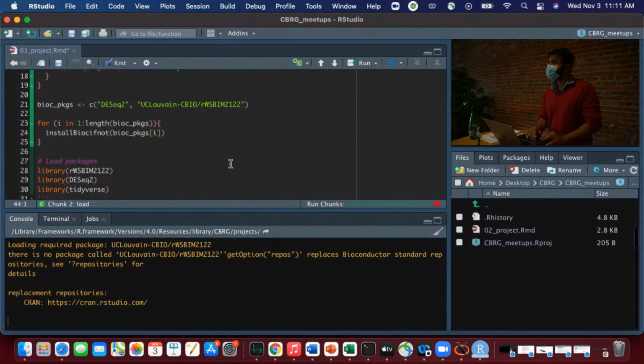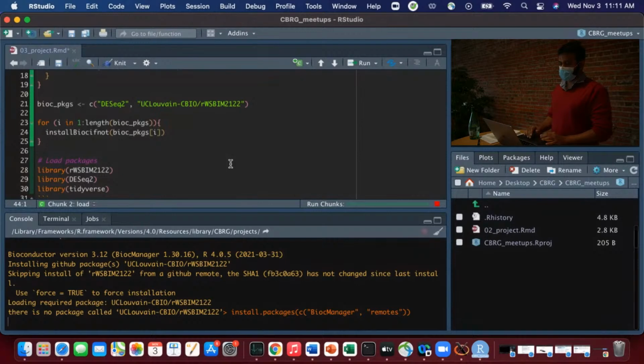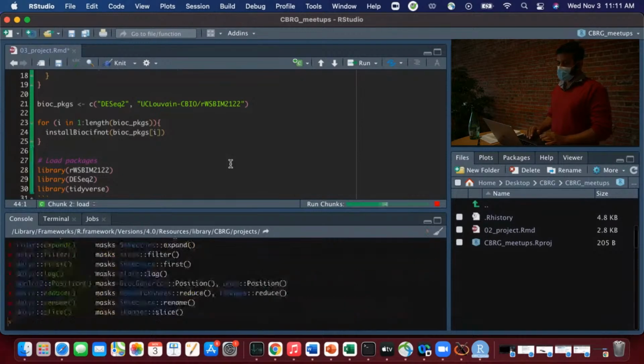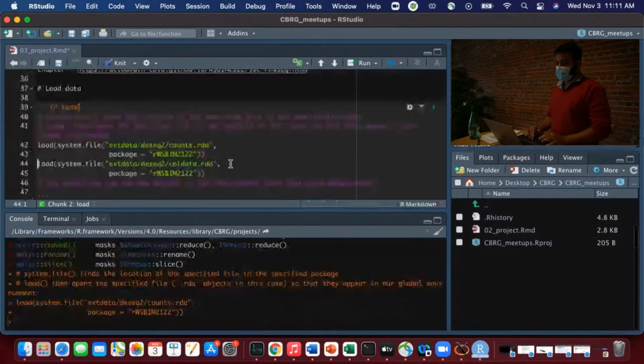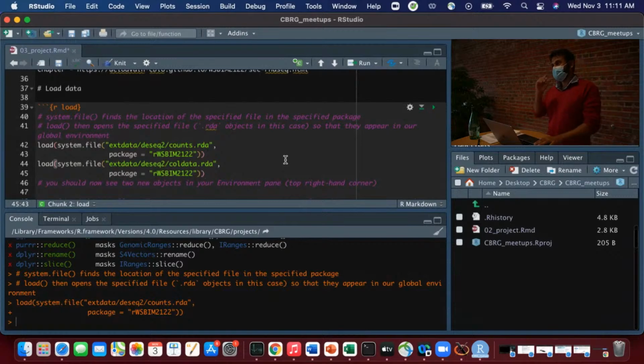Is there a reason why when we run some of these lines, we don't get as much info in the console as you're getting? Should we be seeing all of it? Are you getting any error messages? No, it's just not showing all these lines. I'm not really sure why. Okay, all right. I would say that's actually preferable to seeing all of this stuff.